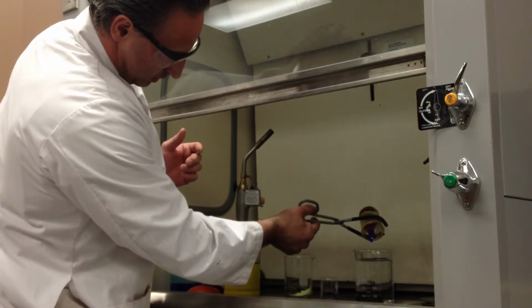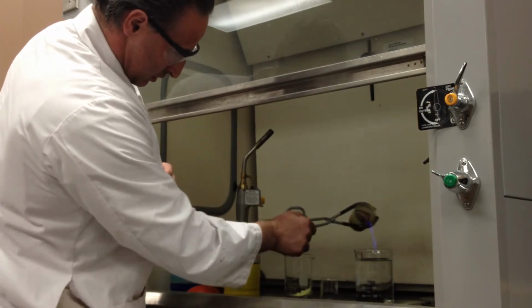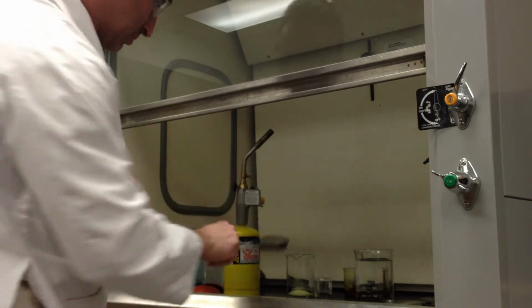I heard this is. Is it like solid now? It's burning now. We're going to leave it over there. I melted the tongs a little bit.